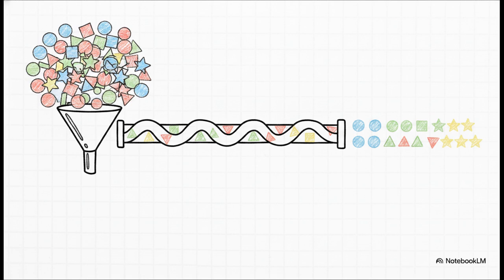Hooking a chromatographer up to the mass spectrometer acts like the ultimate bouncer managing a chaotic crowd. It separates the mixture, basically forcing the molecules to form a single file line based on their chemical properties. Because these high-efficiency columns completely separate the compounds, the mass spectrum of each individual component can be determined one by one as they finally exit the column and enter the mass spec.